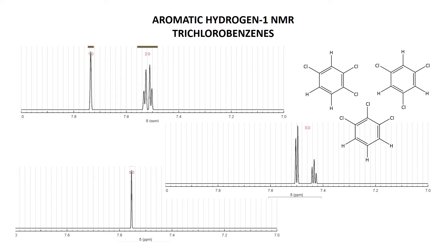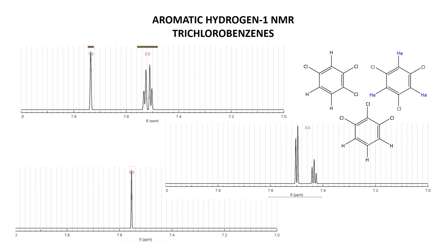There are the three spectra associated with these. Let's see if we can figure out which is which. I would always go for the most symmetrical first, and the most symmetrical is the 1,3,5. Each hydrogen is equivalent — each is on a carbon between two carbon-chlorines — so we'd expect one signal, a singlet. Right down in the bottom left-hand corner is such a spectrum: three hydrogens worth, one signal.